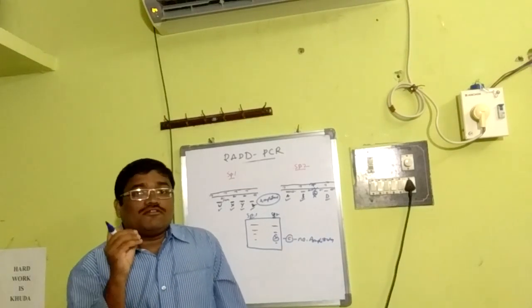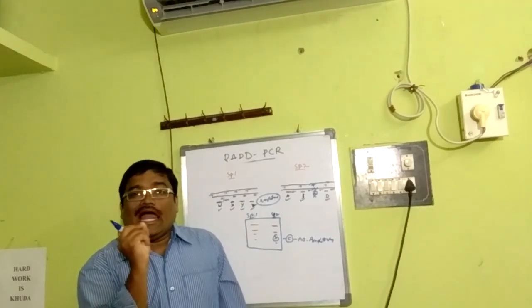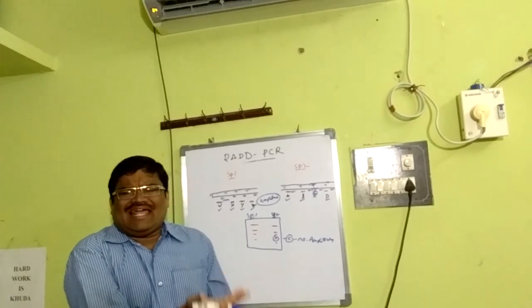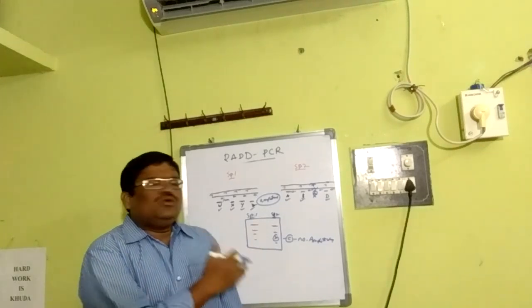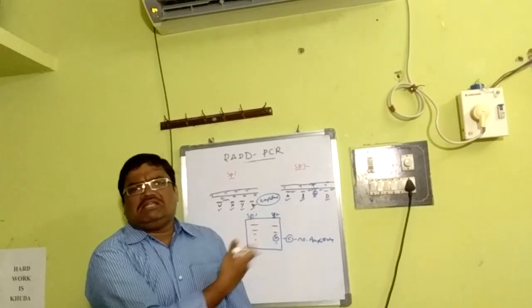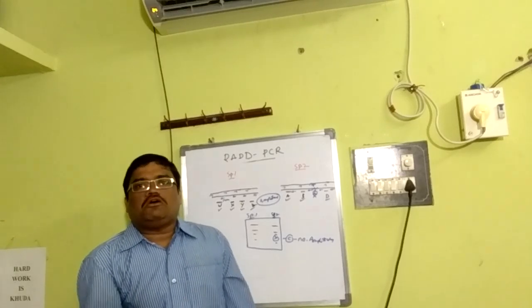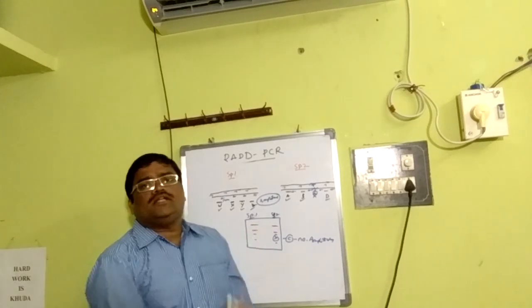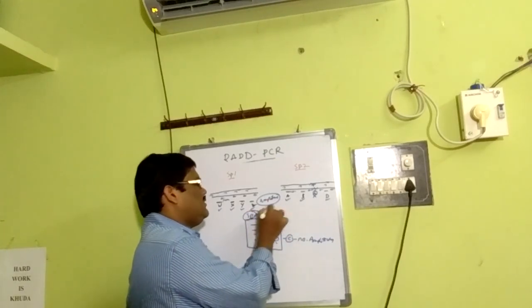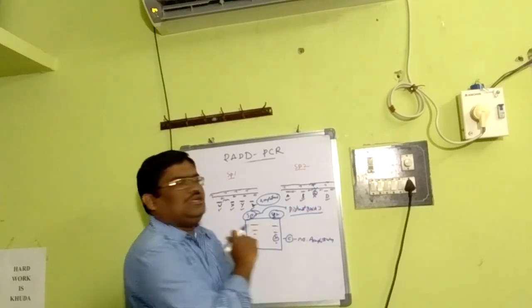Say SNPs. Because of this, I told you already, polymorphism is the crux point for identification of genetic variations. So the entire scenario, what I call the analysis of the banding pattern, you compare these two things. That means the banding techniques. You say there is no match, it is not similar. They are different. Why is there no similarity? Because of variation, maybe because of polymorphism, mutation, or just somehow because of these there is no match. So we establish that these are distinct DNA fragments, distinct DNAs, and there is no real correlation.